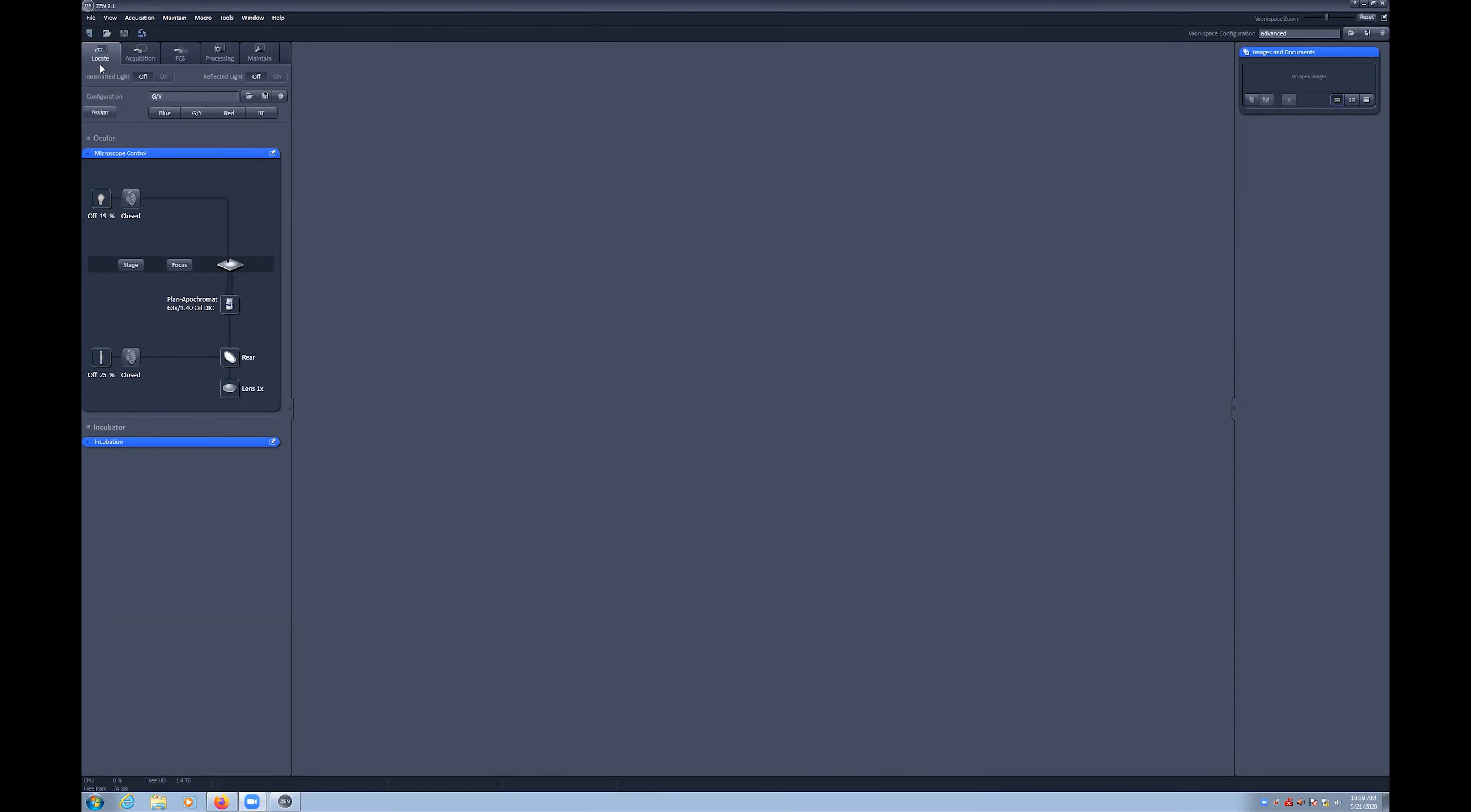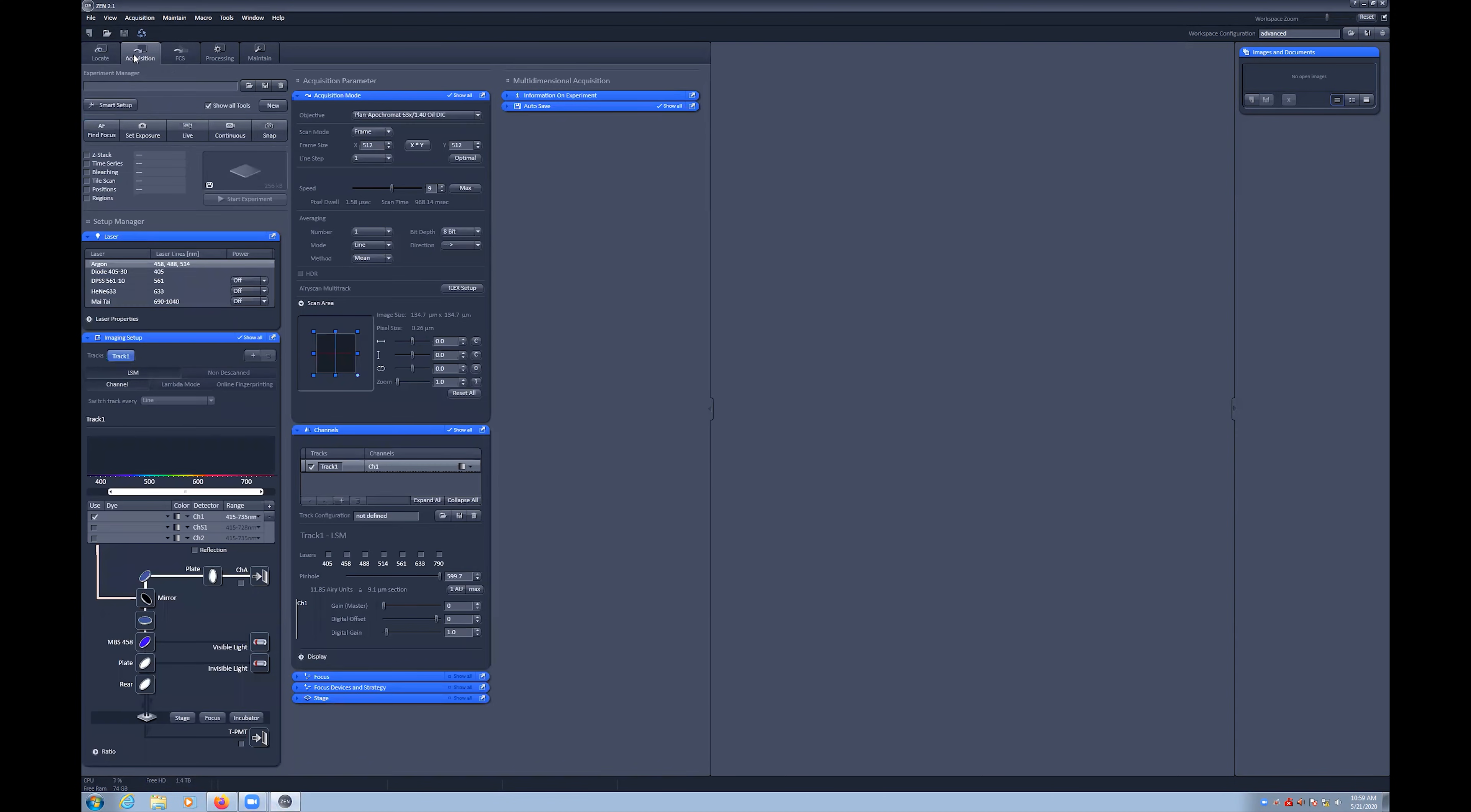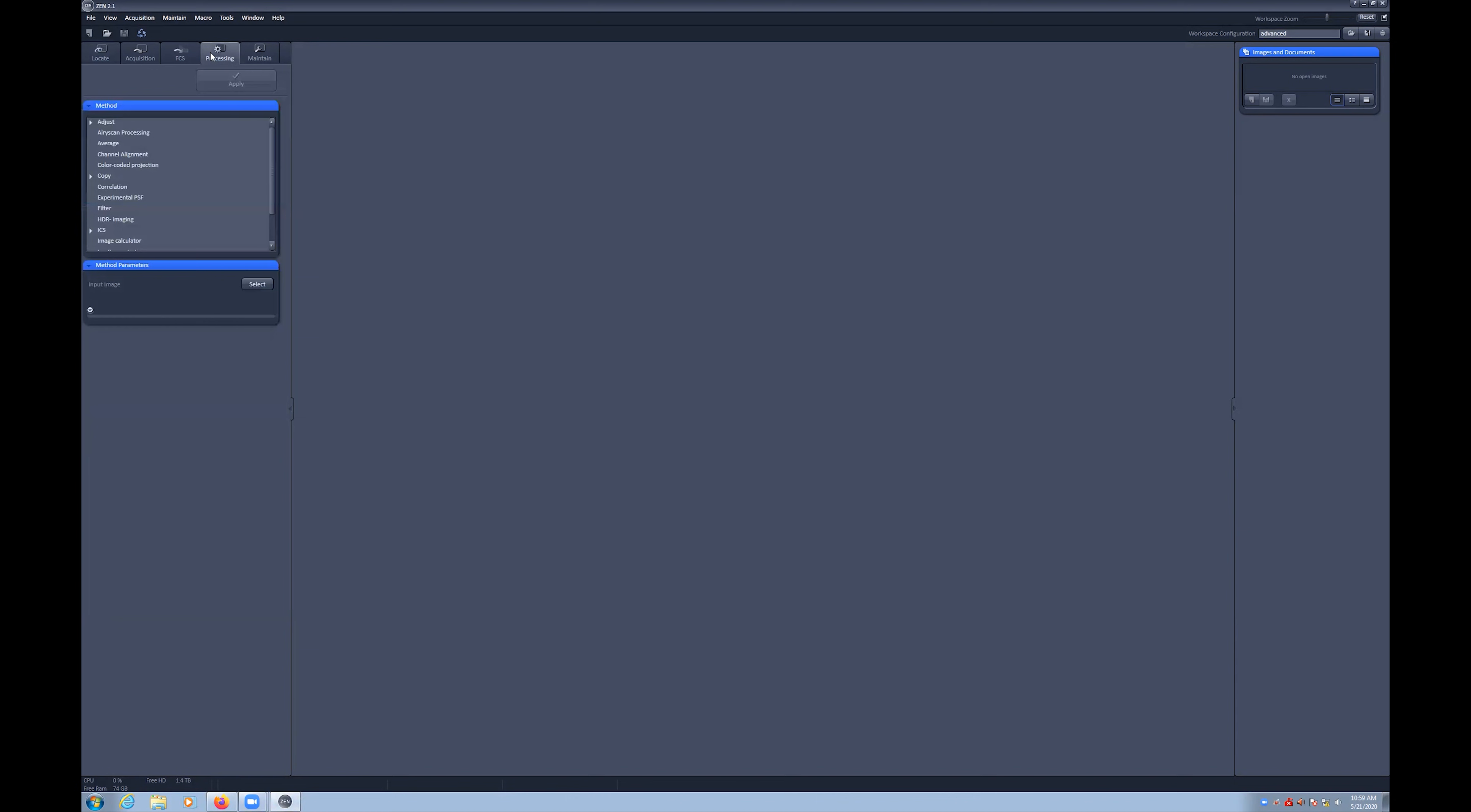The locate tab is used for finding your sample via the eyepieces using the fluorescent light source. The acquisition tab is used to configure your confocal imaging experiment. The processing tab is useful for a few processing steps. However, most of these can be preferably completed offline on one of the virtual analysis computers, instead of taking up time on the acquisition device. Use of the maintain tab is only required for advanced users and is not covered in this series.